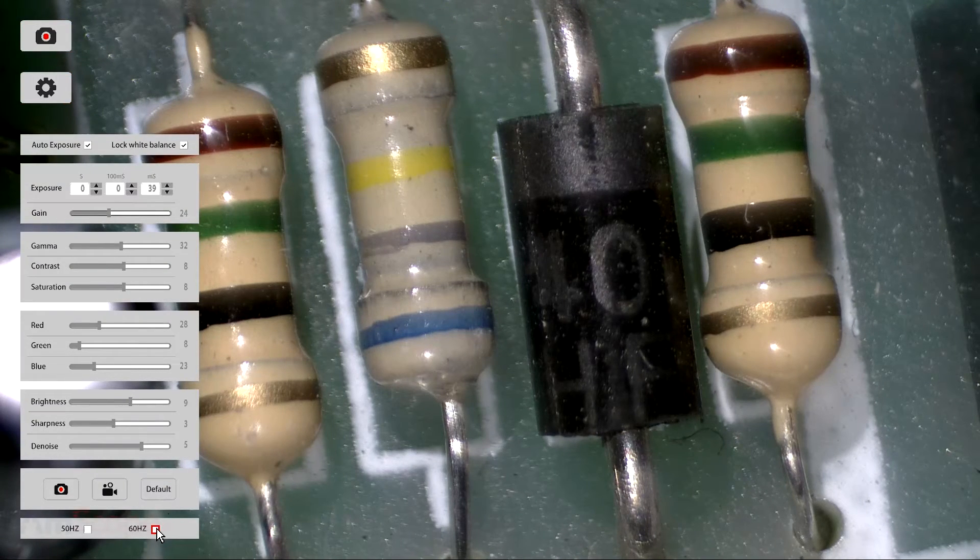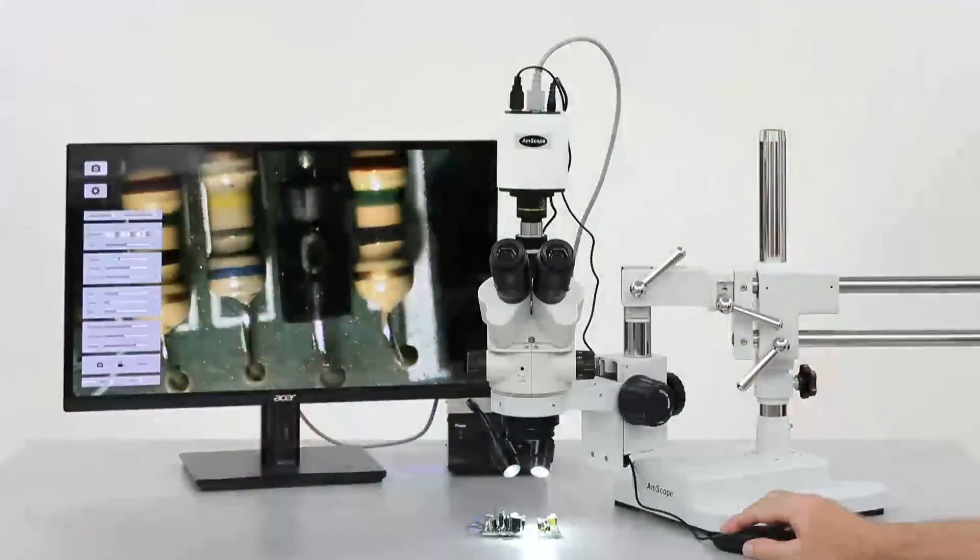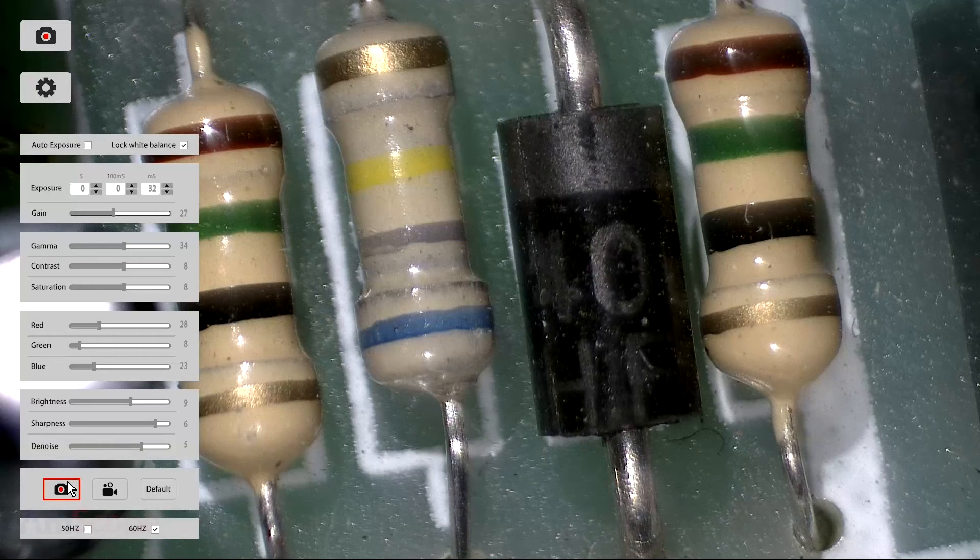At the very bottom, you can select an electrical line frequency to control flickering. At the very top, you can enable or disable the auto exposure and white balance. Disabling these will give you full manual control over the other settings, such as exposure, gain, contrast, and color. Near the bottom are two very important buttons. The left camera button is for taking still images. The right video camera button, as you might suspect, is for recording videos.